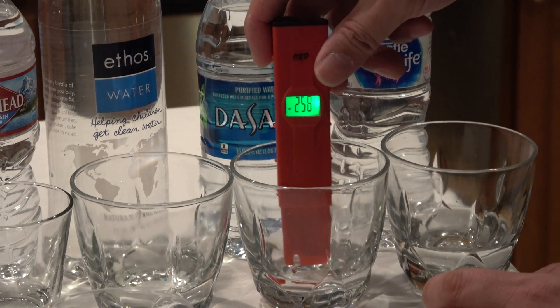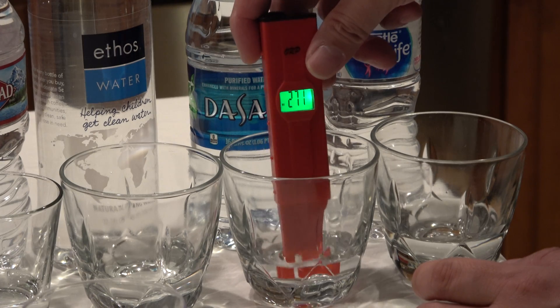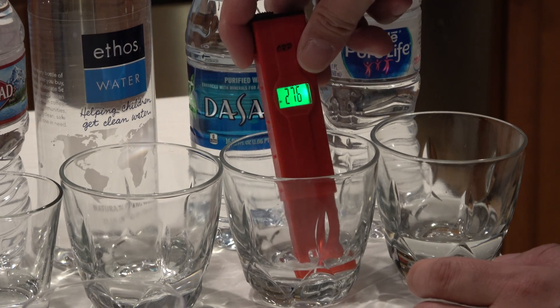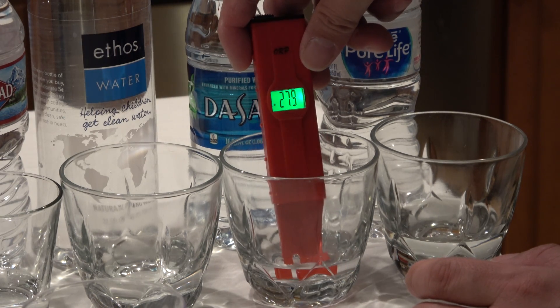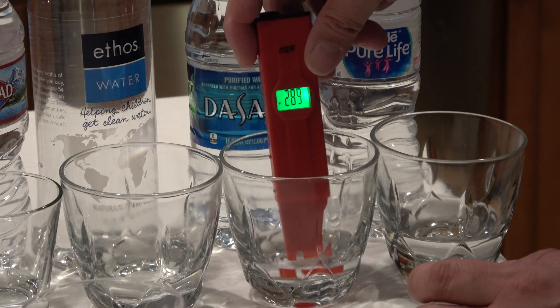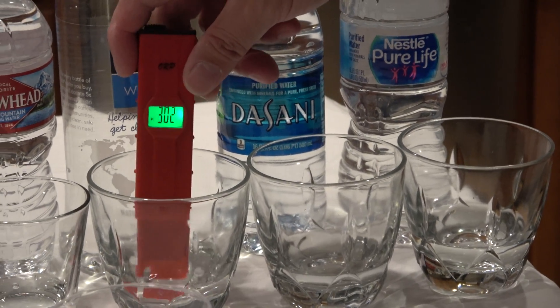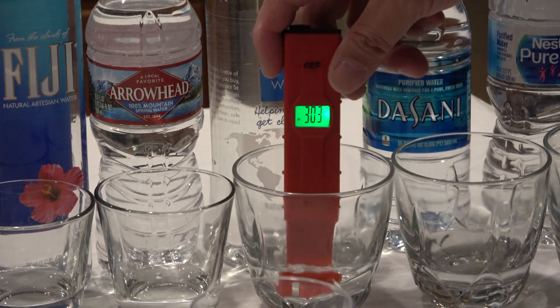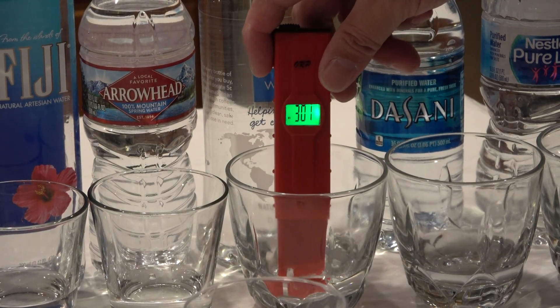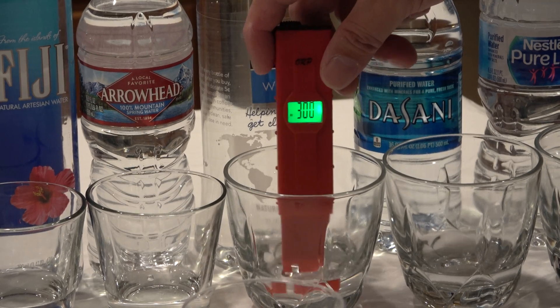Sunny water is around positive 280 and climbing. So the Ethos water — this one is positive 300.